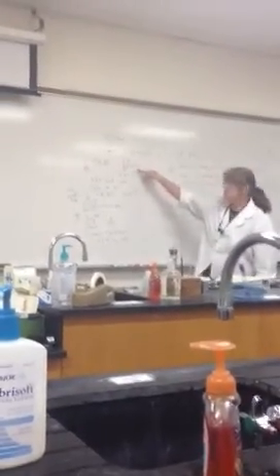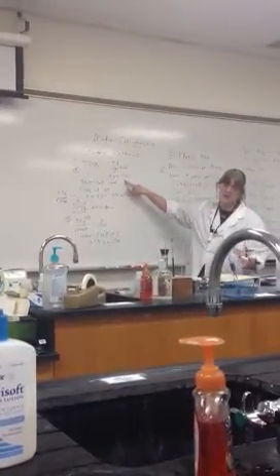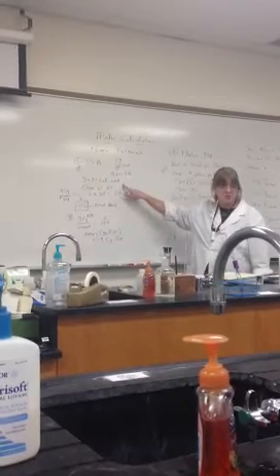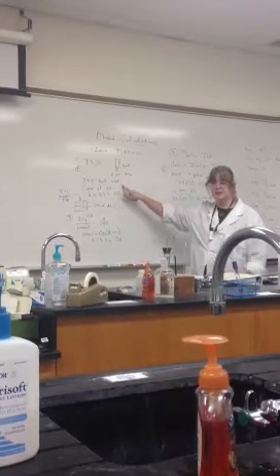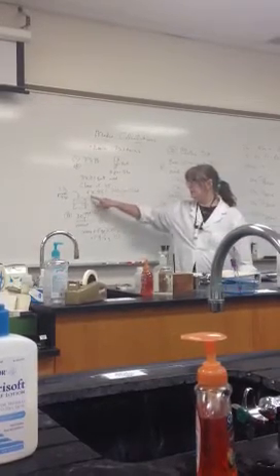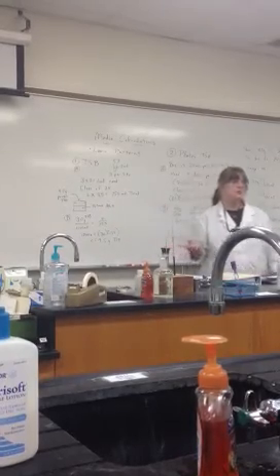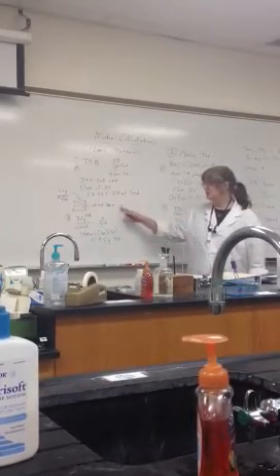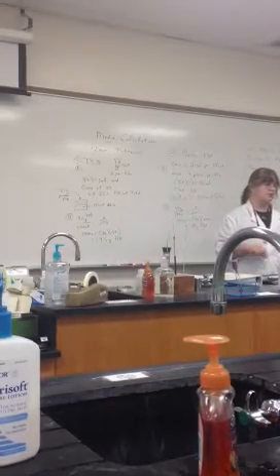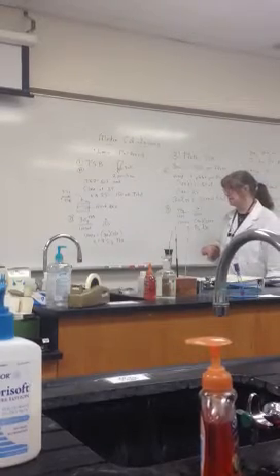How many mils in each test tube? I said 3. How many per student? In this case, 2. Now, these can change. So you need 6 mils per student. But you have a class. You're not just making it for one person. So we say 25 people, 6 times 25, you get 150 mils. That's a nice number. What does it represent? It's the volume that you're going to have. In this case, distilled water you're going to add to the powder.